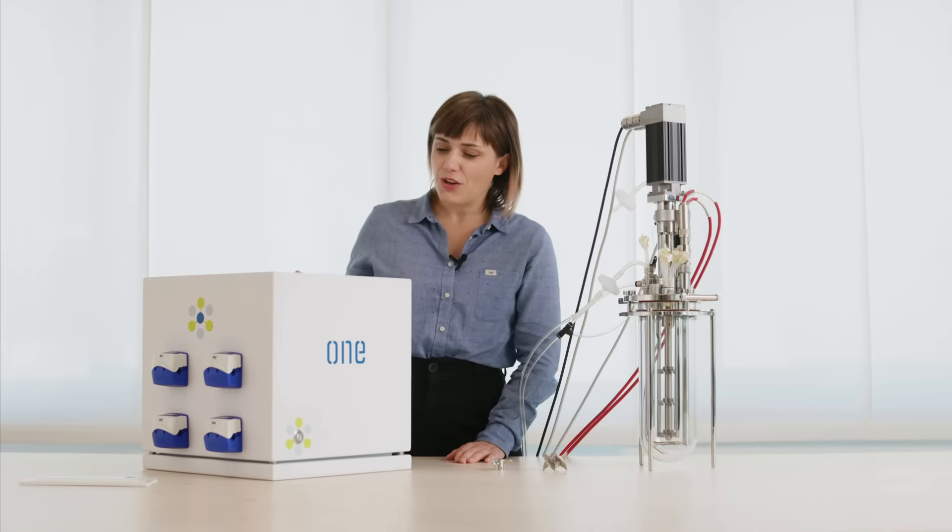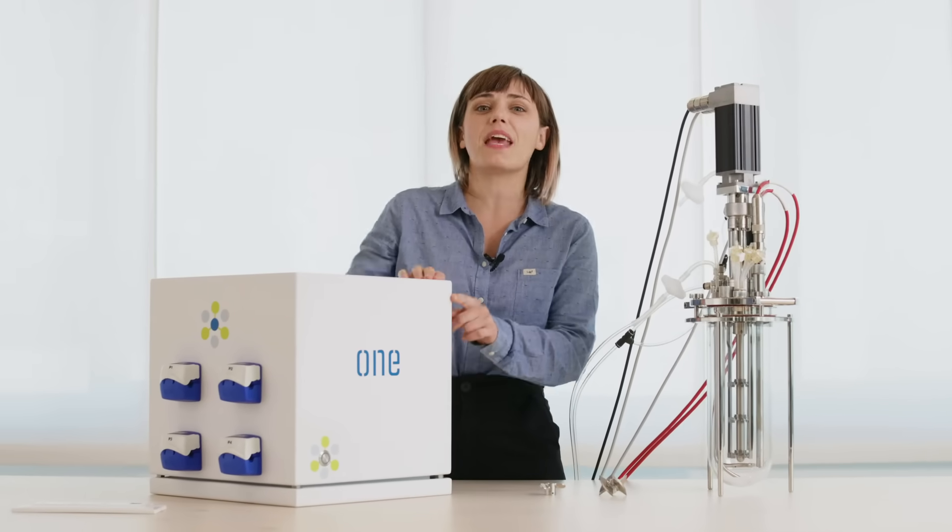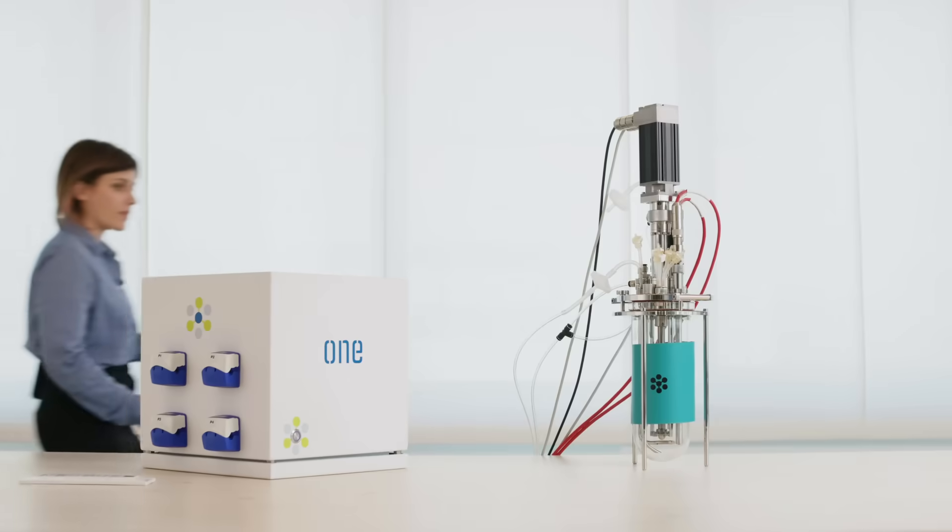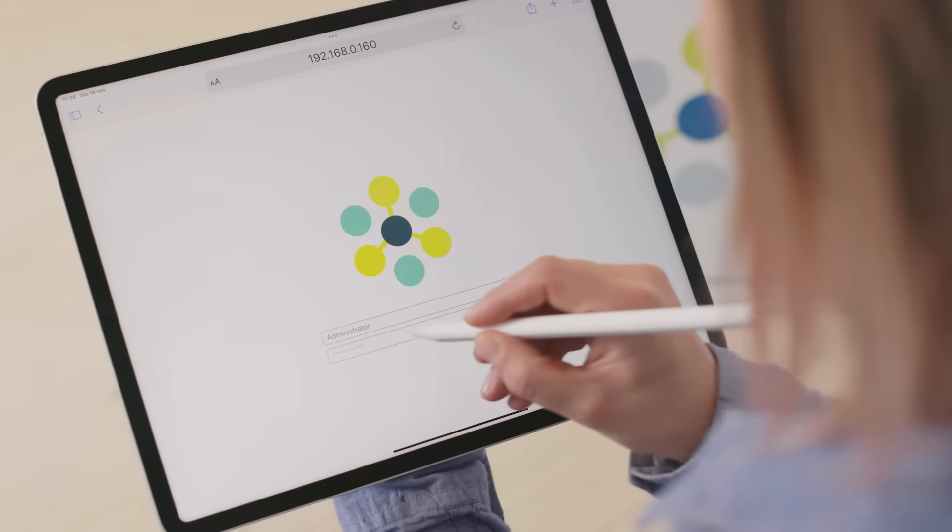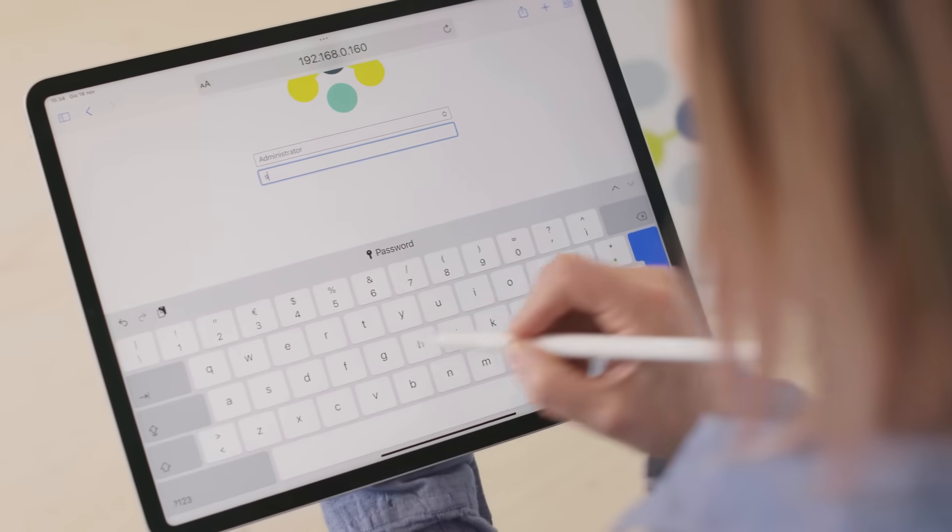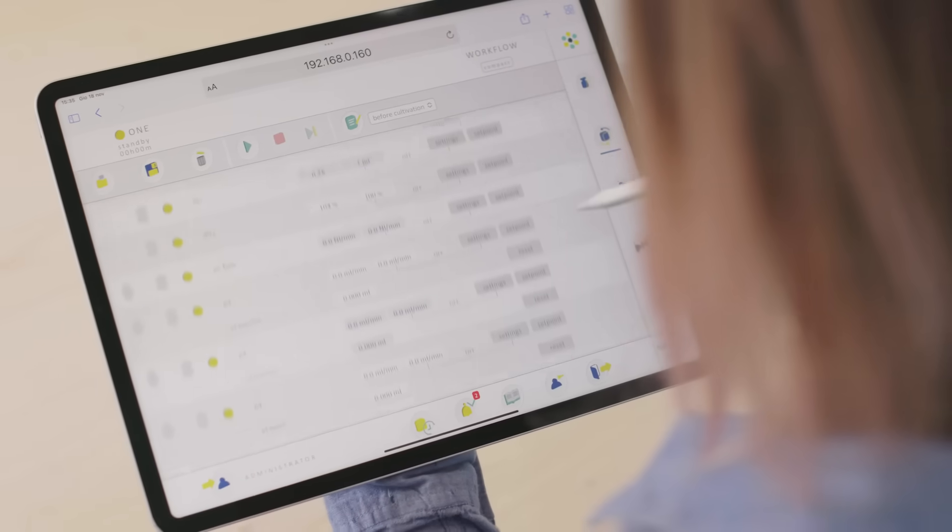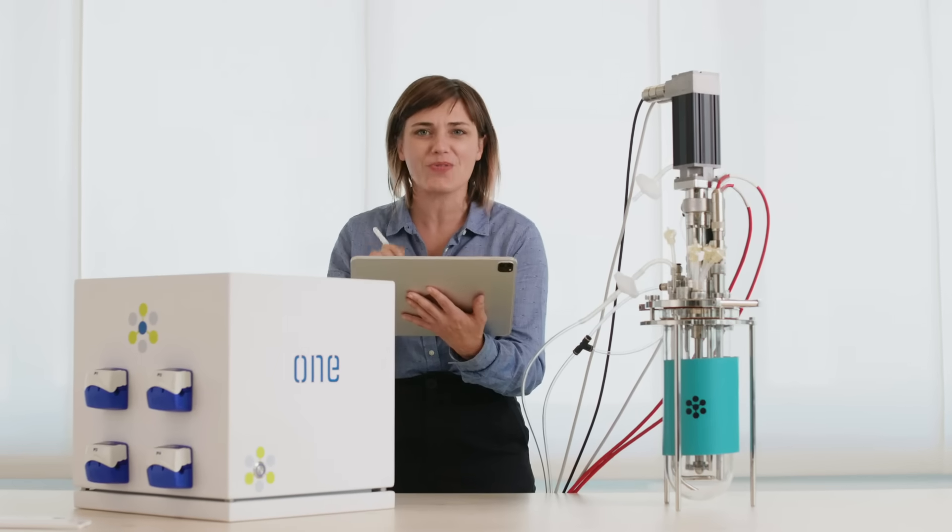The cube is a smart and ergonomic PLC-based control station, and Leonardo software is the user's best friend in experimental design, planning and performing trial runs, as well as analyzing and optimizing media and parameters for cultivation.